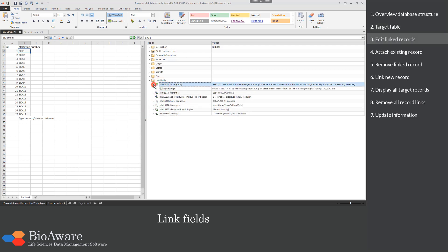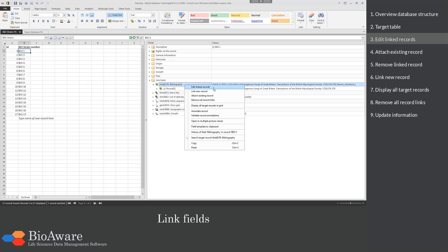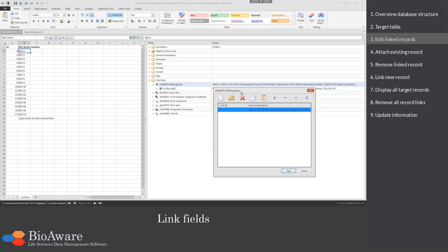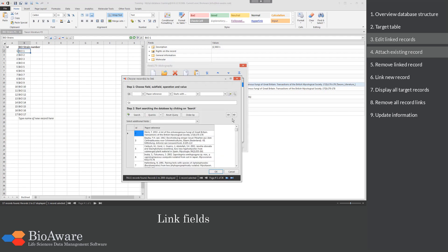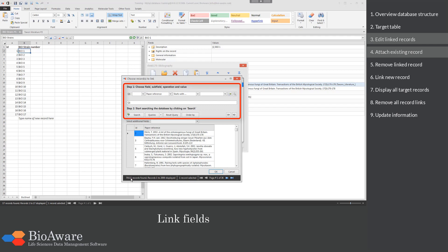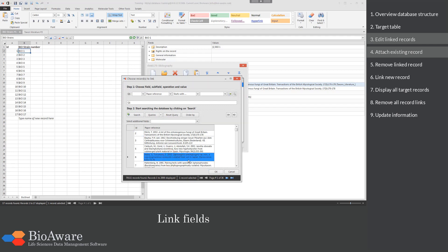When you want to edit the linked records, right-click on the field and select Edit linked records. There we can attach a new record, choose to attach an existing record, or remove a link. Here we are going to attach an existing record. All records of the target table are displayed — in this case the records of the taxons literature table. You can use the search panel to find the specific record, then select it from the list and click OK.